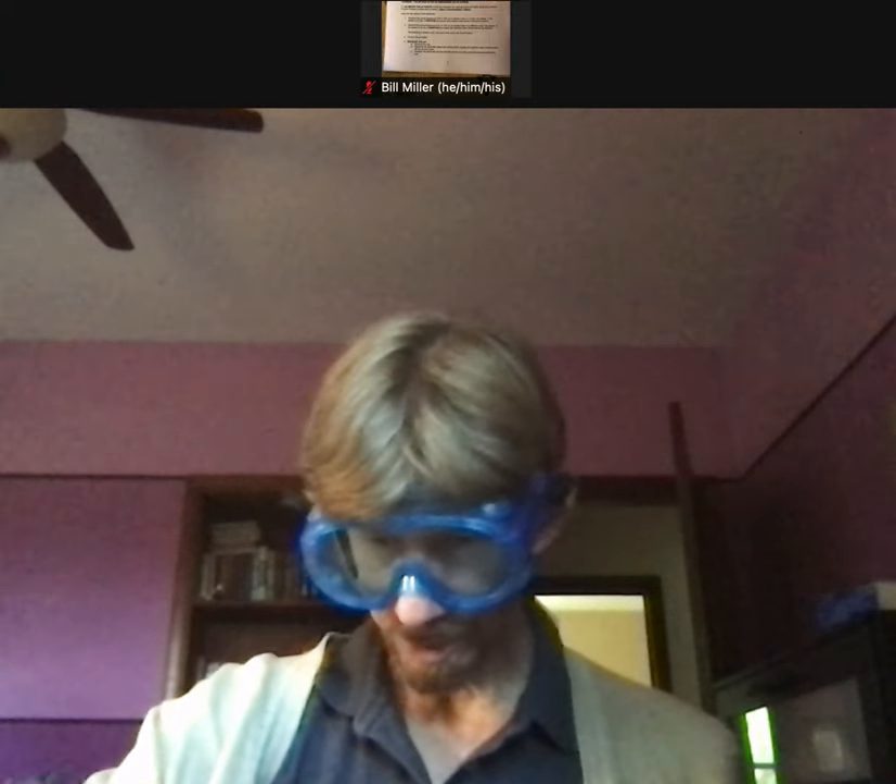Instead of using the 6.86 pH buffer called for in the procedure, we're going to use pH 7 — that's close enough for us. And instead of using 4.01 we're going to use exactly 4. So I'm getting my pH 4 on the left and my pH 7 on the right.